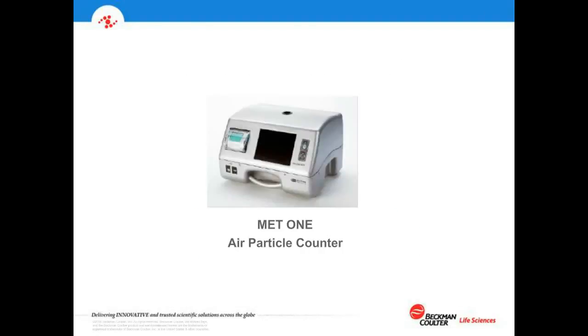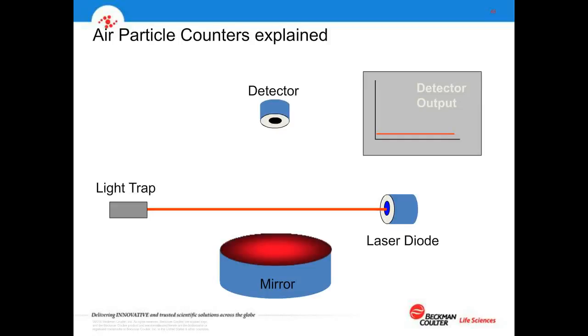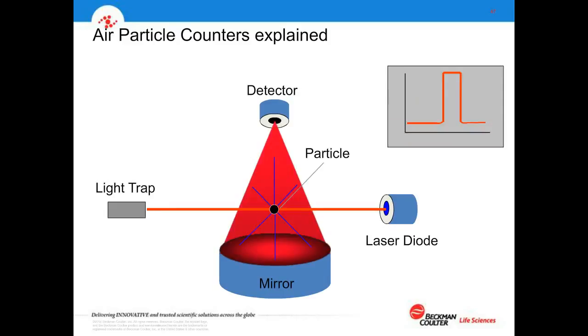So just briefly on the particle counter, we look at this particular instrument and what it does, and this goes to the classification side of it now, getting to look at the 21501 document in particular. Basically, a particle counter uses bright light in a mode known as light scattering to detect particles. So we have a beam of light, today it's typically a laser diode, and we pass particles through that. As a particle gets into the beam, it scatters light. From that information, we understand A, an event occurred, and B, by the amount of light scattered, we have an idea of the size of the particle.